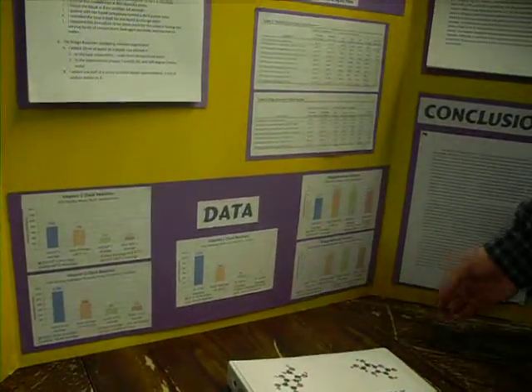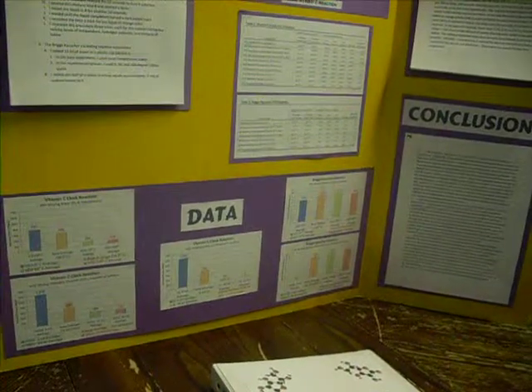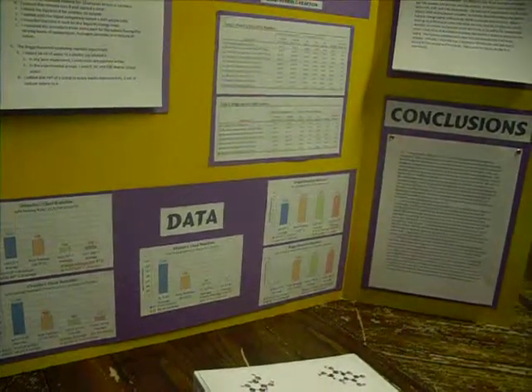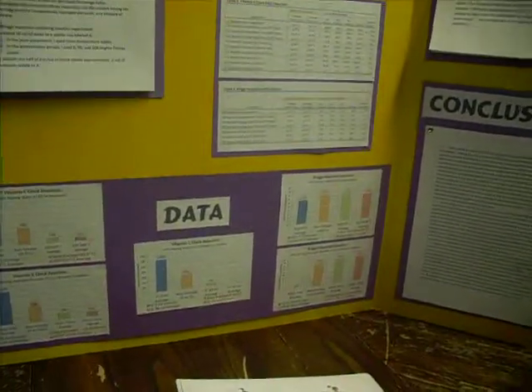This is the Briggs-Rauscher one. This is the temperature one, and it goes up and curves down, which doesn't make any sense, but oh well. This is the Briggs-Rauscher reaction, one with the varying hydrogen peroxide. It went up, but after the 0 milliliters one, there's not much of a change.